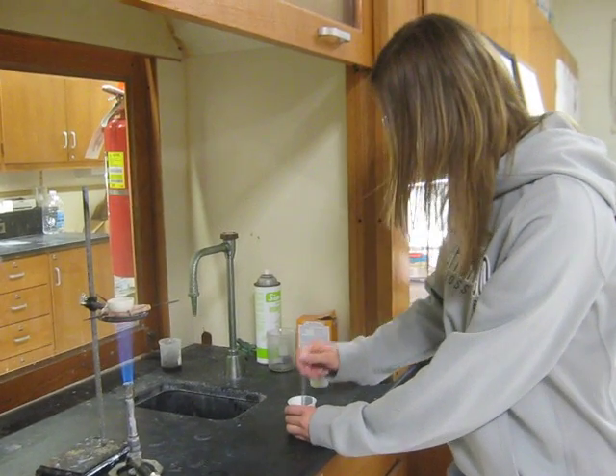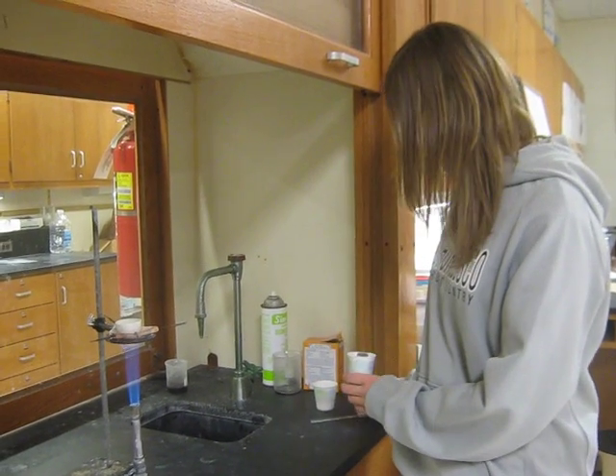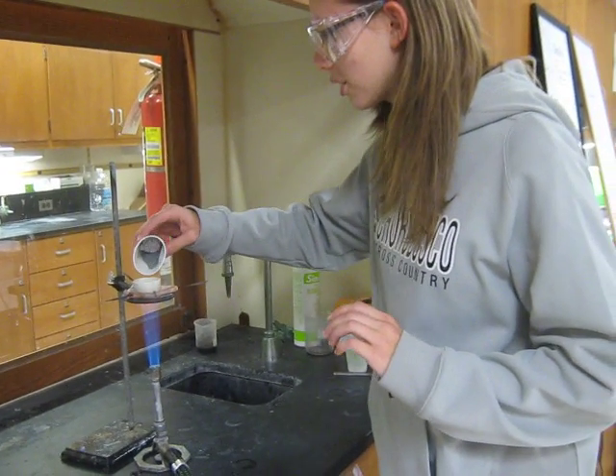Now that my mixture has been mixed, I will now pour it into my crucible.